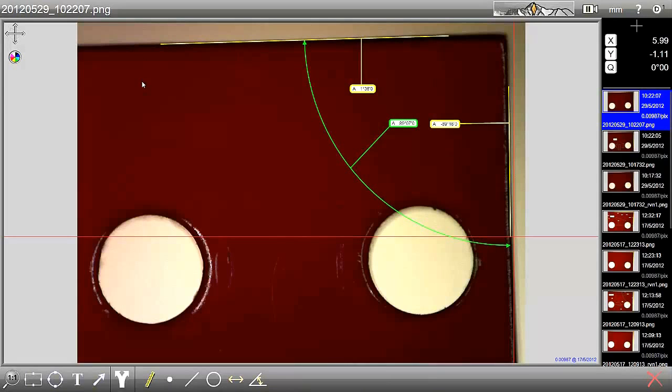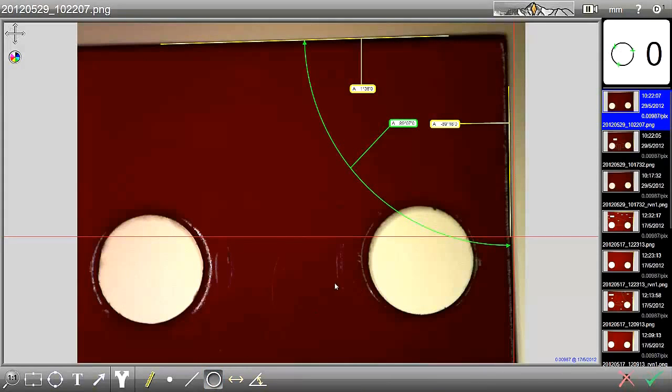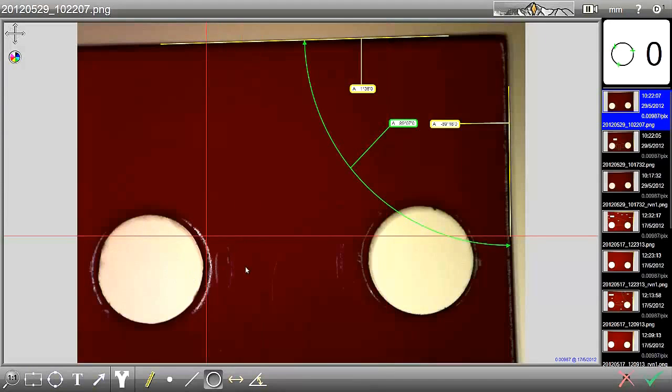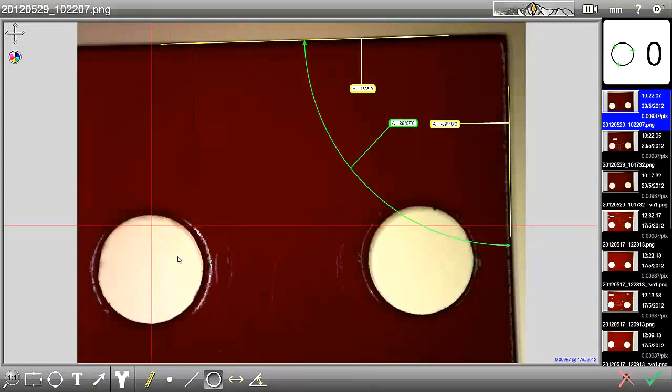We can also dimension a circle. So we click on the circle icon at the bottom here on the toolbar. And again, we can use between 3 and 9 points. For speed, we will take 4 points here.